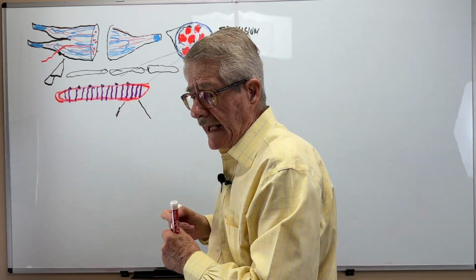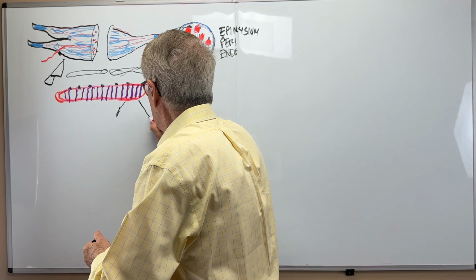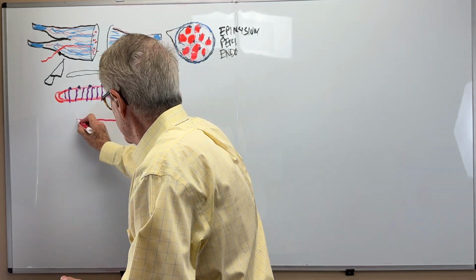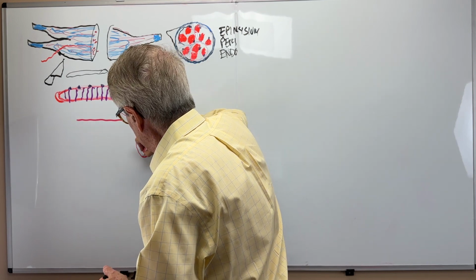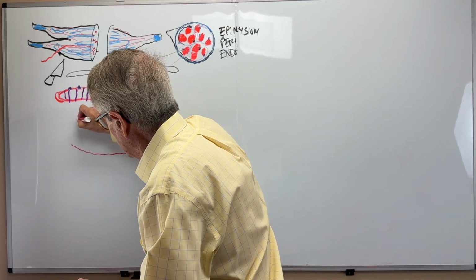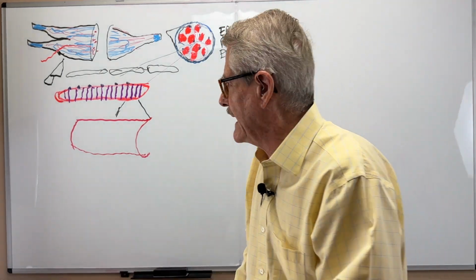we're going to have a cell that goes this way. We're cutting the cell. And that has multiple nuclei, as we know.